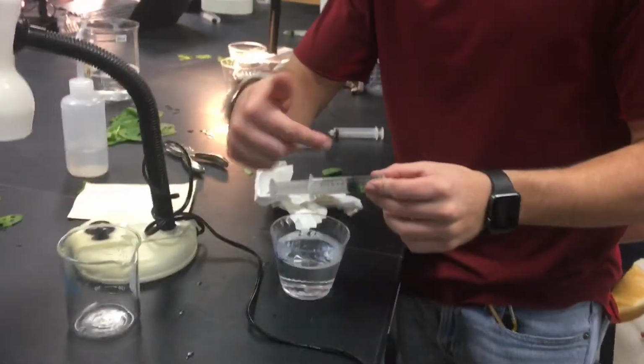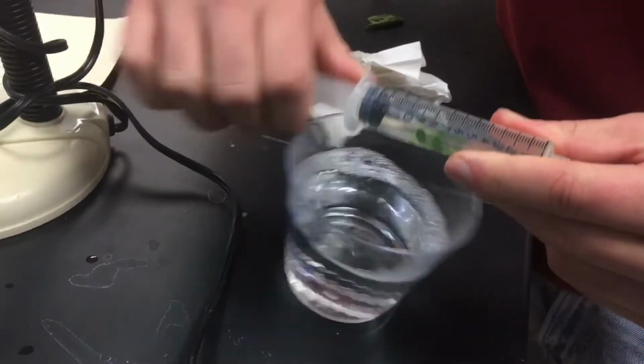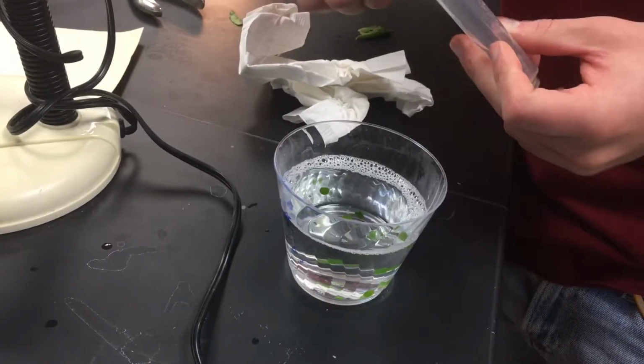Once all the air has been released from the leaf chads, pour them into a cup full of sodium bicarbonate. Then move the cup into your desired location with the correct light intensity. Once moved to this location, set a timer for 15 minutes and check every minute to see how many leaf chads have floated up. Take data and then repeat for different setups.